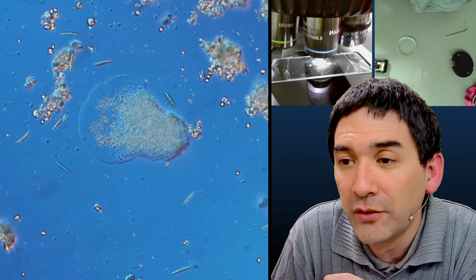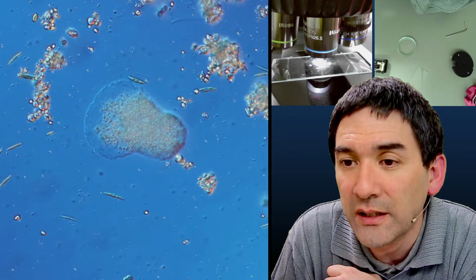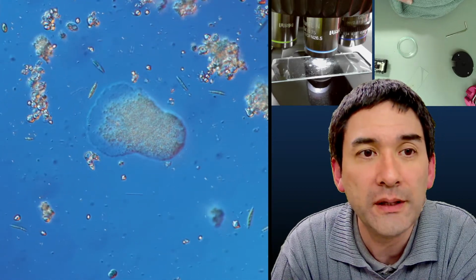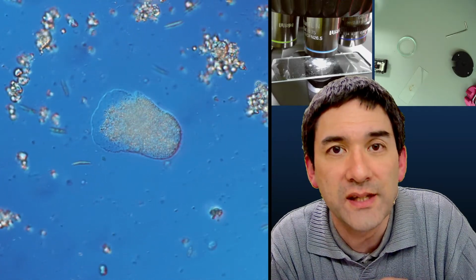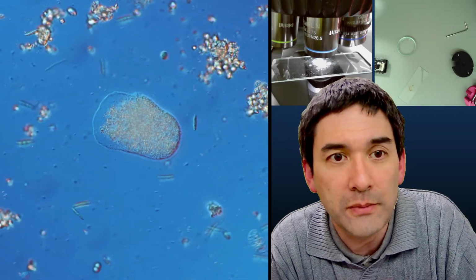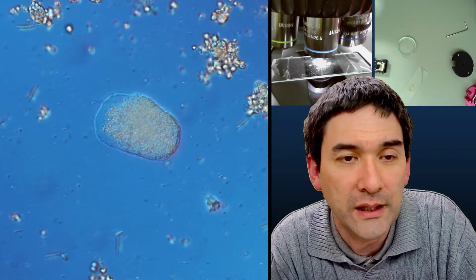Interesting. Never knew about carmine staining DNA. I feel like I've tried blue inks, food coloring, which stains DNA too. Ideally, some positively charged compound. The carmine, there is a stain to make the dividing cells visible, the chromosomes, and that's carmine acetate. It's called carmine with acetic acid. And now the cell starts to become a little bit rounder again.